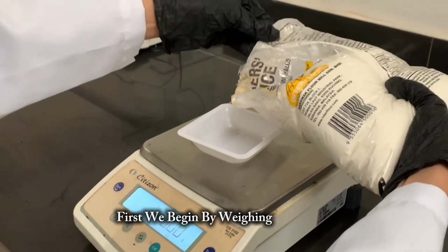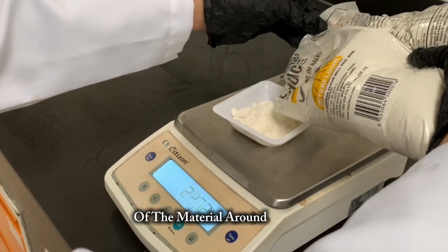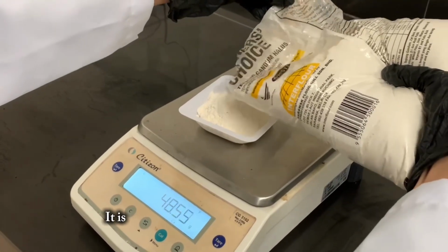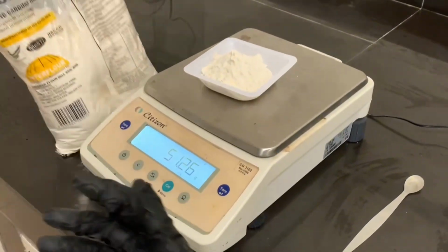First, we begin by weighing the sample. Using a digital balance, we measure a known amount of the material, around 50 grams. Depending on the material used, it's important to record this initial weight accurately for later comparison.